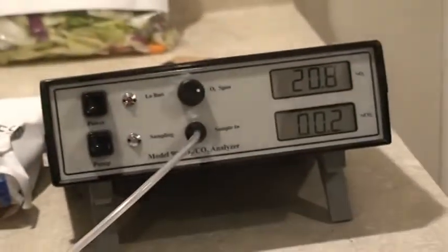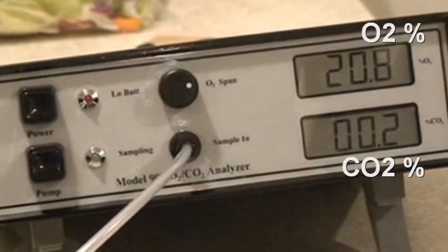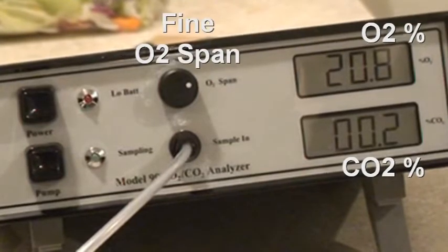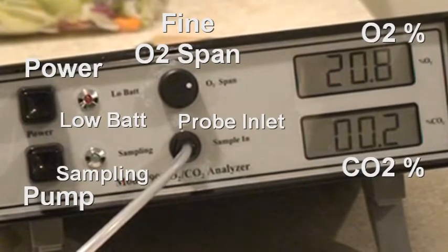As you can see, it has tip-up feet for use on a bench top. The controls are O2 and CO2 display, fine O2 span on the top, power, pump, low battery indicator, as well as a sampling indicator and the probe inlet where the sample probe screws in.